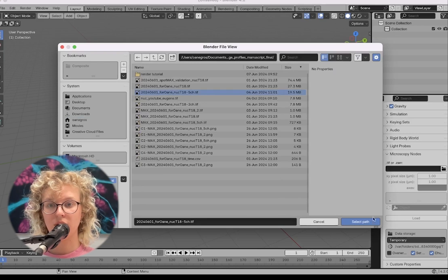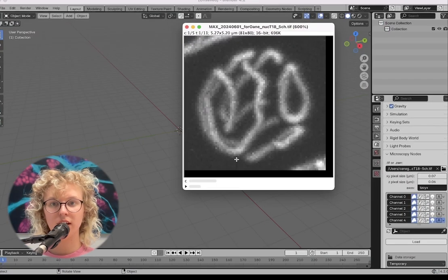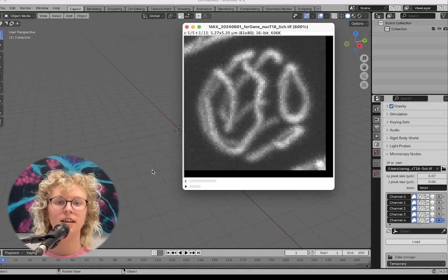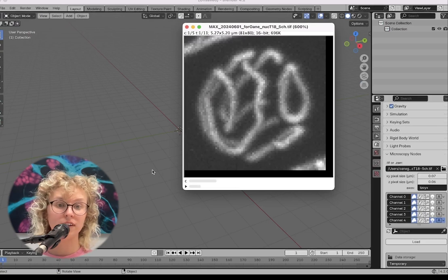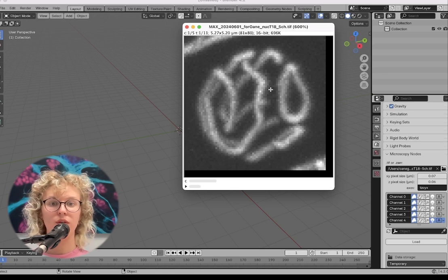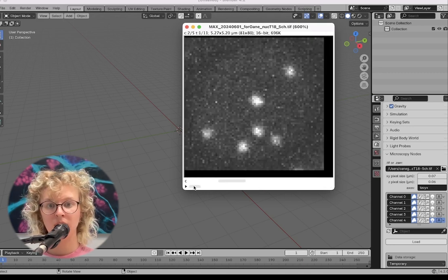So let's go to a quite complicated Tiff file. I'll quickly show how this looks. This is a bit of a weird data set. This is from my lab, from Ivana Chavka. We look at meiosis in C. elegans. And so we have this marker, which is the synaptonemal complex, which holds the chromosomes together during meiosis through time. Here we're looking at the maximum Z projection in Fiji.